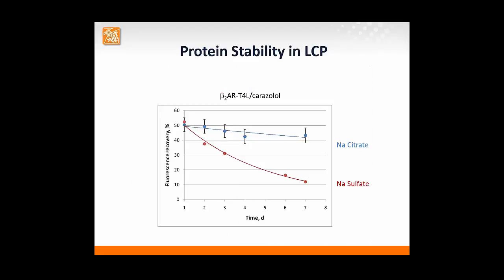Also, diffusion of the protein is related to stability, and you can look at diffusion results at different points in time to see how stable your protein is in different conditions. And also use this to understand for how long you actually need to follow up your crystallization trials.